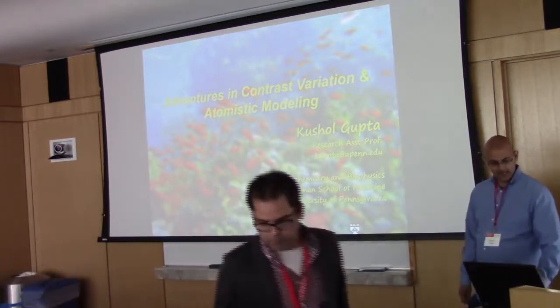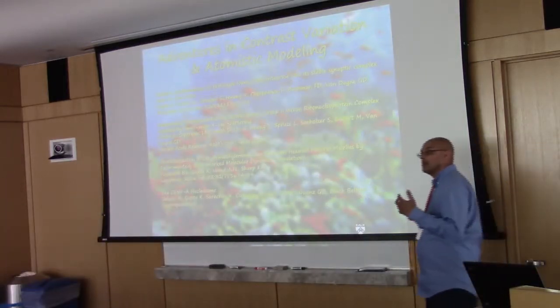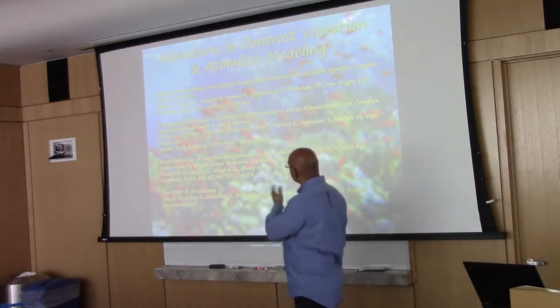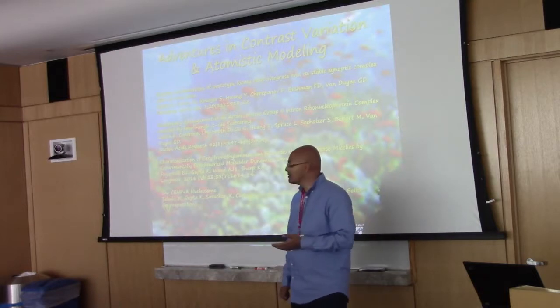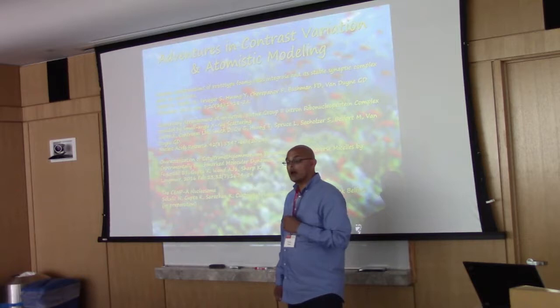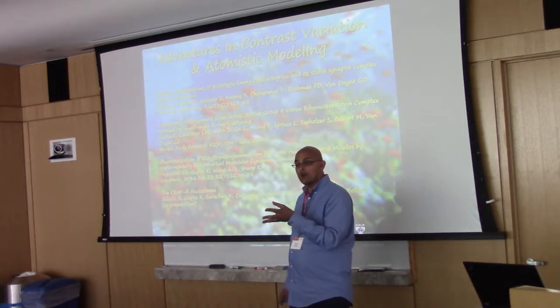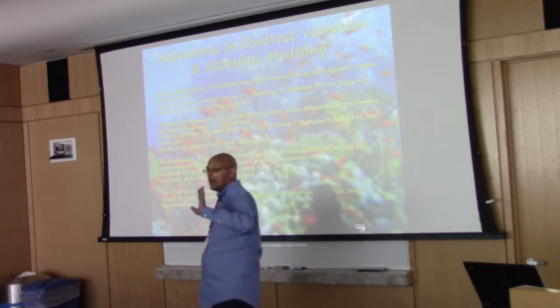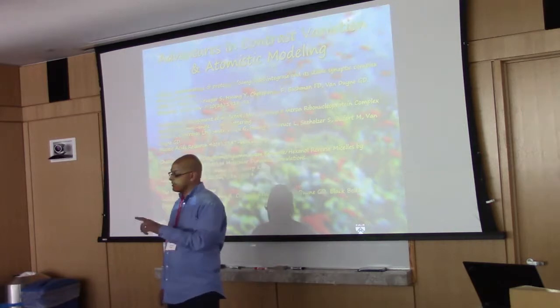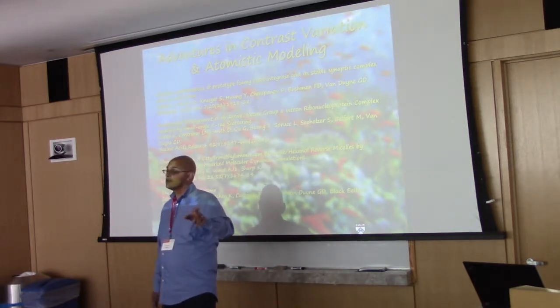Yes. All right, and so what I want to do in this next hour is introduce you to contrast matching and applications and some specific studies that I've been involved in over the years, and also a little bit about atomistic modeling, which is a very different approach to model-dependent analyses that abandons use of shape reconstruction, and directly reconciles an atomic model of some variety with its solution scattering.